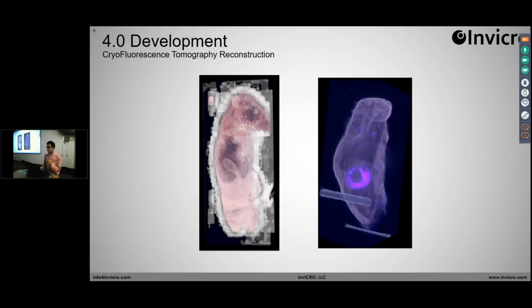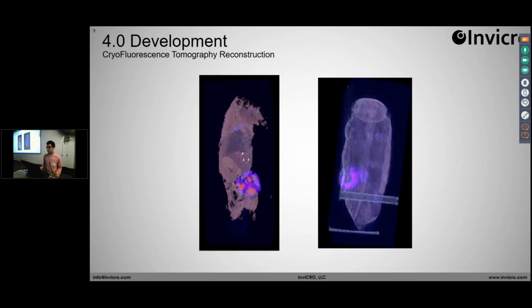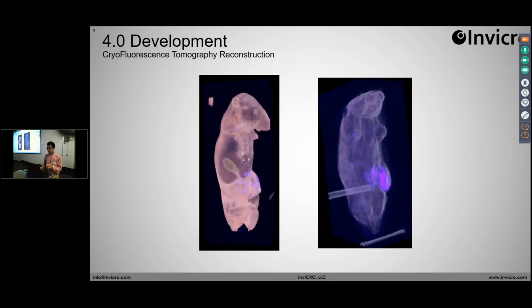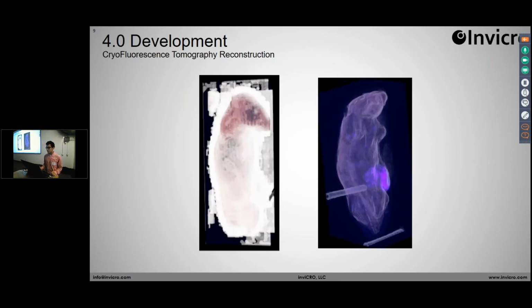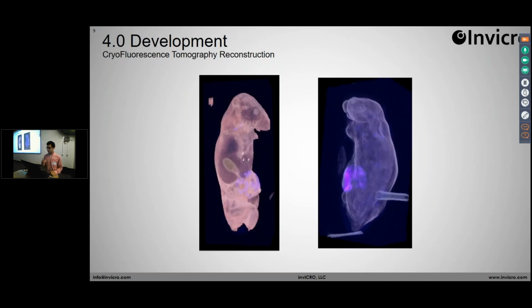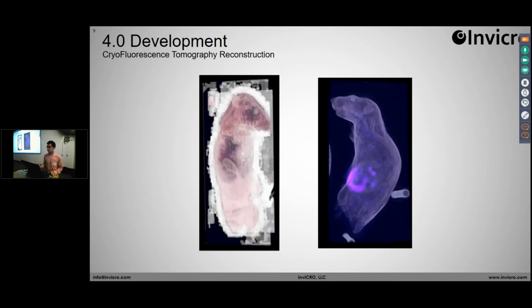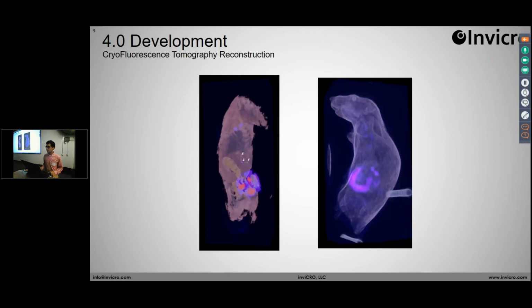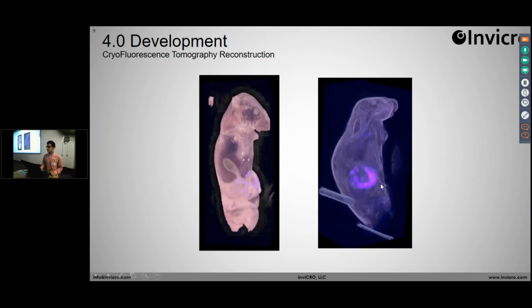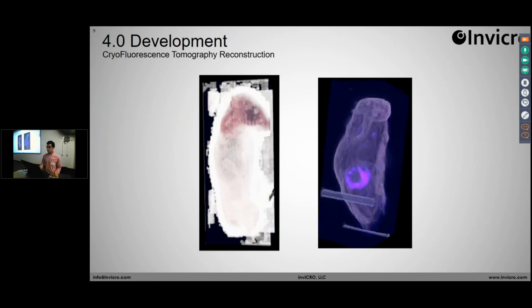This is a 3D reconstructed fluorescence data set, and one where we've constructed a really neat volume rendering, where basically in the projection process, we find the edges of the patient and give those more opacity in the projection, and it really lets you see the profile and some of the interesting internal organs, and these are parameters that can be adjusted.